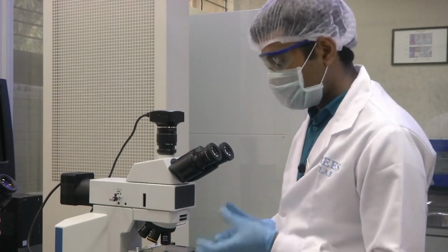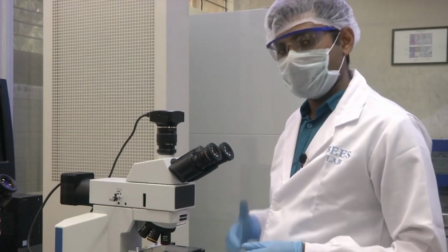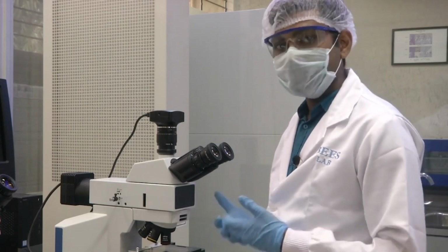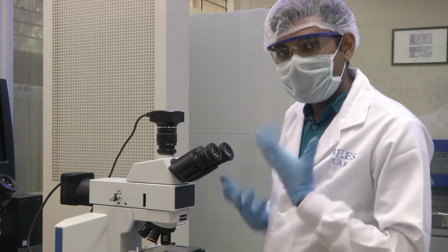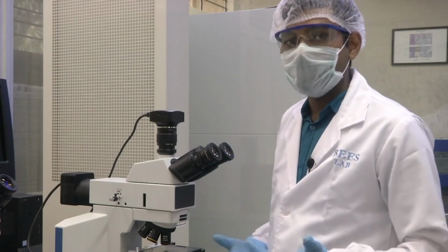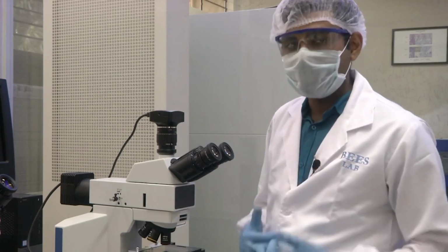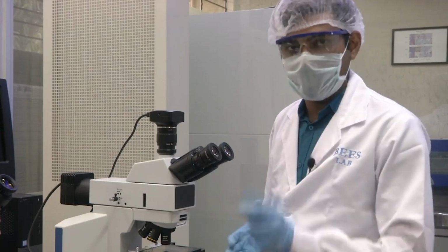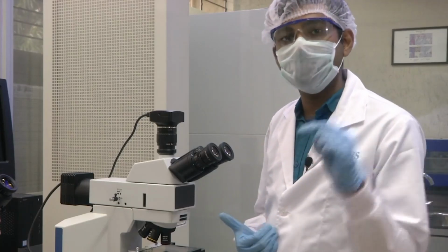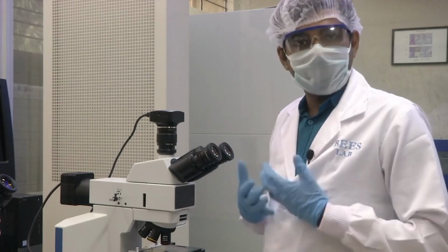So, if you put a filter for blue light on the fluorescence microscope, you can image without using any illumination after adding the chemical, because this sample itself will act as a light source. Why? Because this is fluorescence. You add a chemical to the sample, it reacts with the chemical in a specific manner, and it starts emitting light from specific regions within the sample. That light is captured.